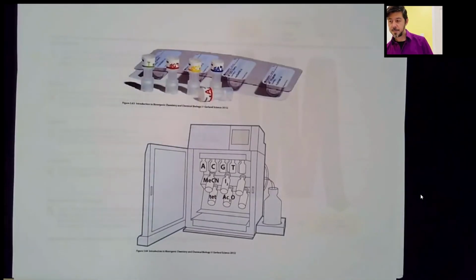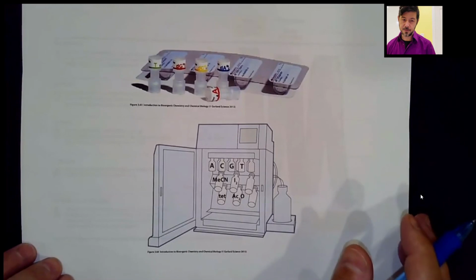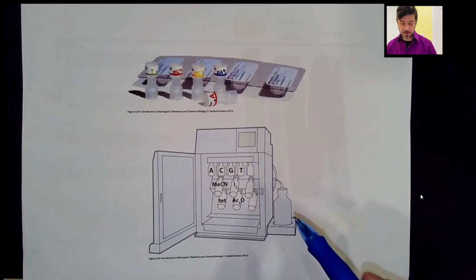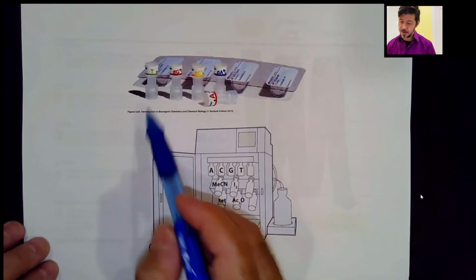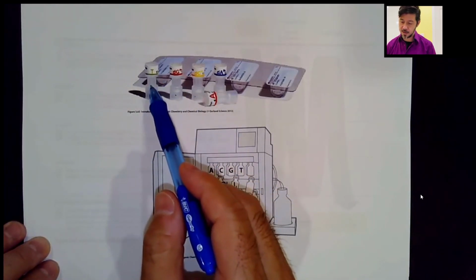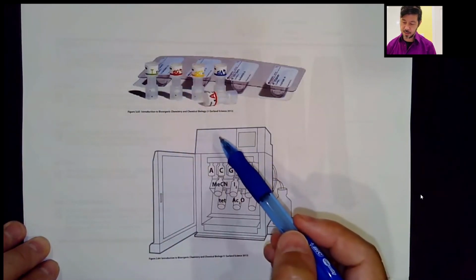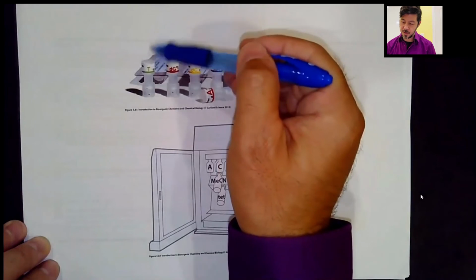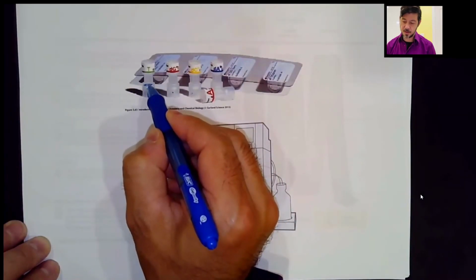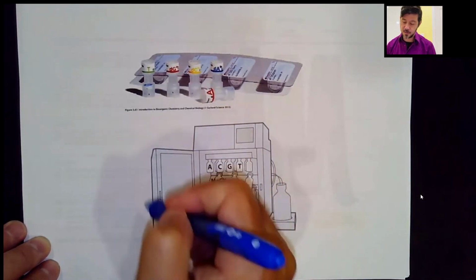This is a picture of what a machine kind of looks like from the inside. And I just want to highlight a couple of things here. We have these little cartridges that we can purchase, and inside is the controlled pore glass bead. So you fasten it to the machine, and then you can push solvent through, and then there's a frit that doesn't allow any solids to go through. So you do all the reaction on the bead, and then you can rinse through.